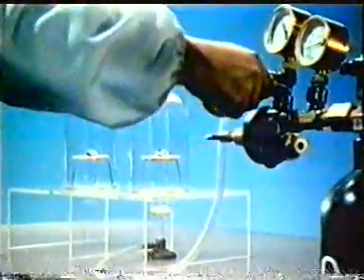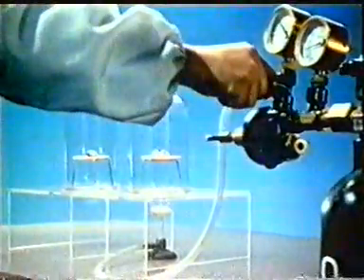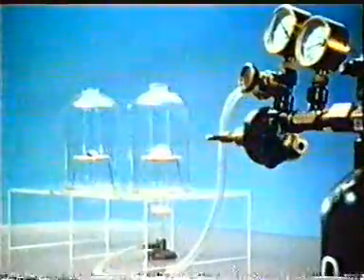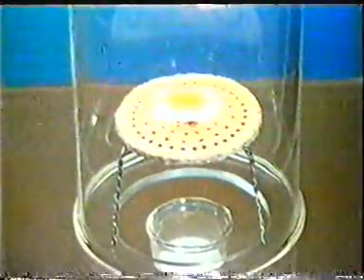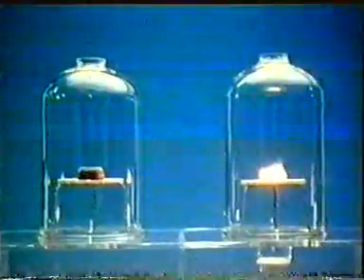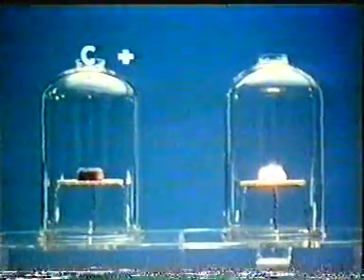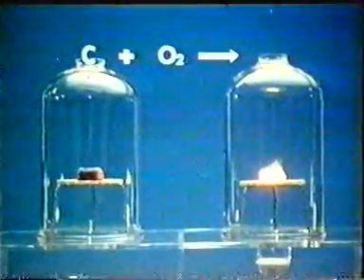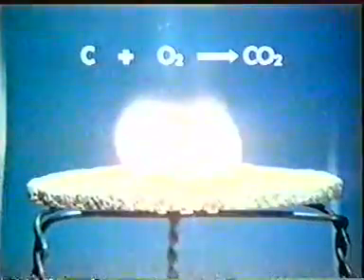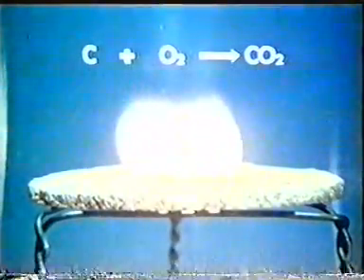Oxygen is slowly let into one of the bell jars. The charcoal burns more quickly in the bell jar to which we are adding oxygen. The same chemical reaction is taking place in both jars. Carbon is combining with oxygen to make carbon dioxide. But the reaction is not taking place at the same speed.